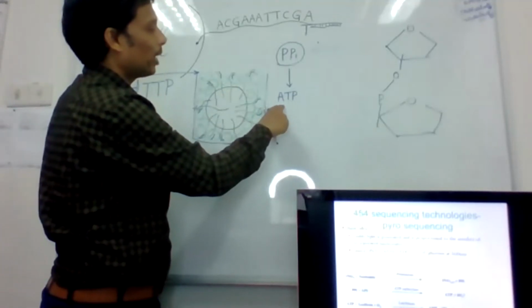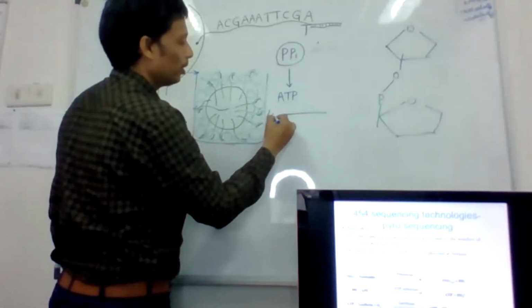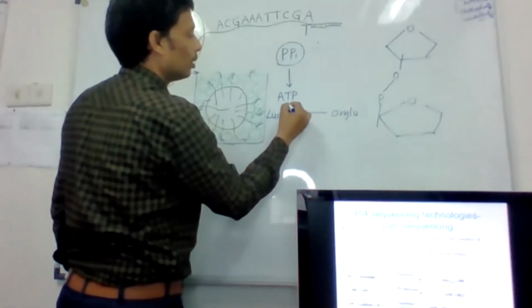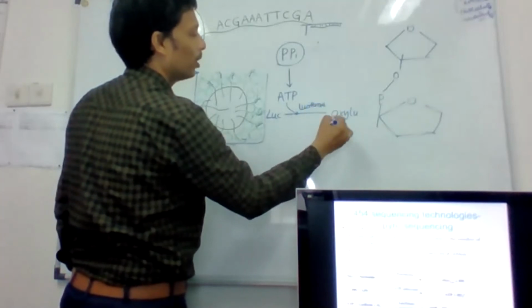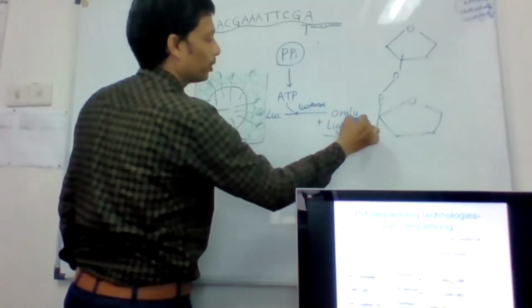This ATP is utilized in the third reaction, where luciferin is converted into oxyluciferin, with luciferase, plus light. So light is important here.